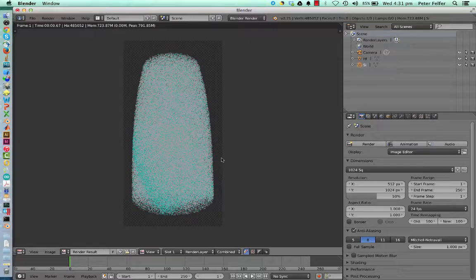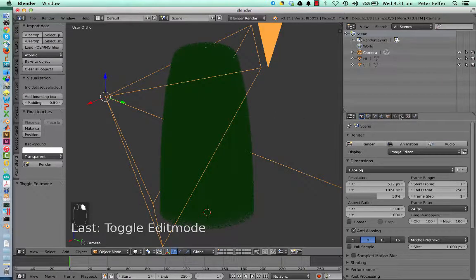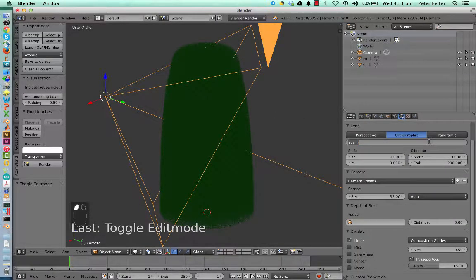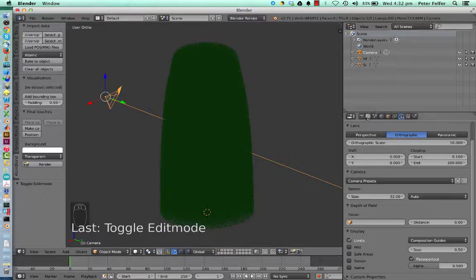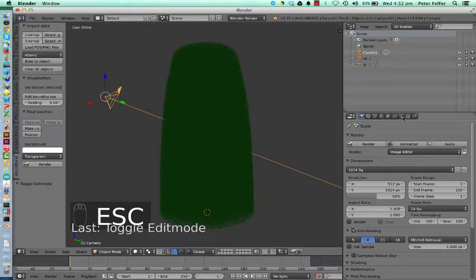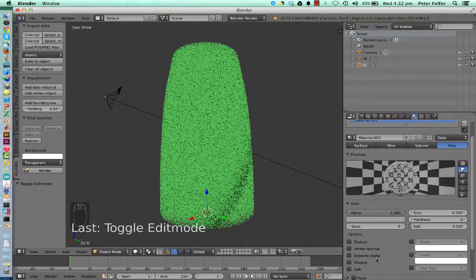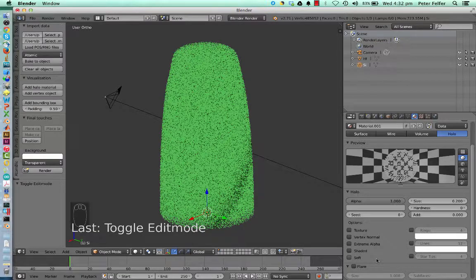The only thing is we're gonna add the texture, because if I select the camera and change the orthographic scale so that we are zoomed in, you will see that what we call the hafnium atoms, they've got these circles around them, but the silicons don't. And in order to change that, we'll go onto the silicon again, into the material, and add a texture to the material. So what the texture is, it's just some sort of image that's applied to this thing here.